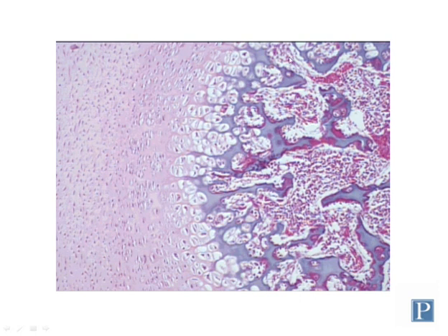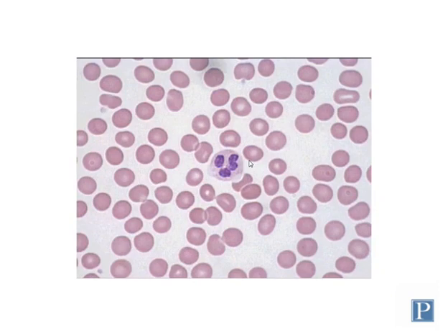You will need to know those for the practical, although I won't quiz you on those specific zones for the quiz yet, so just make sure you're able to identify those on your slides for the practical. So that about covers it for bone.